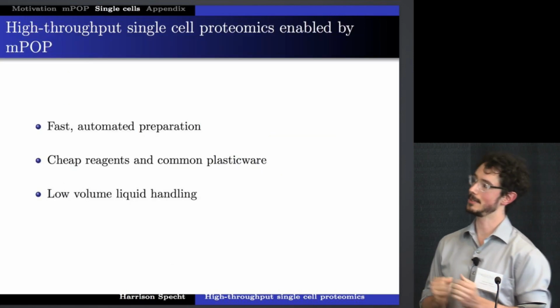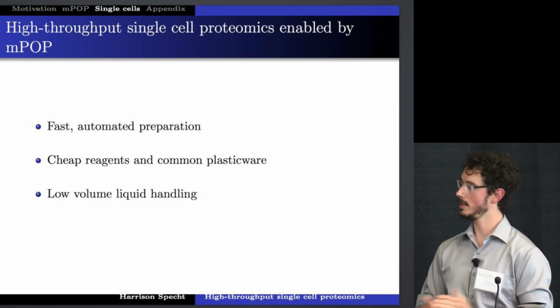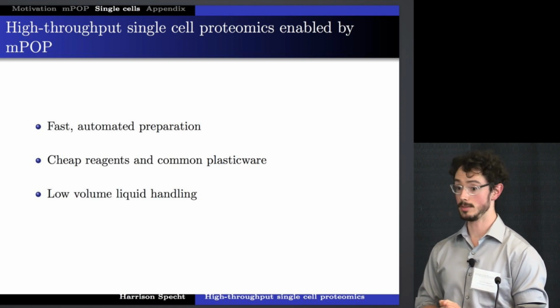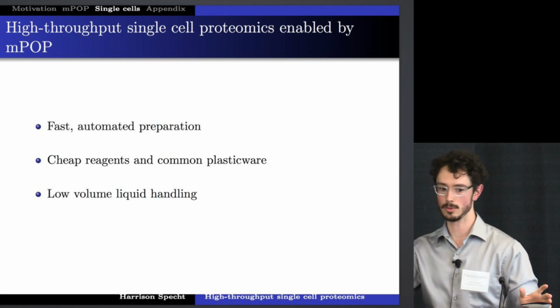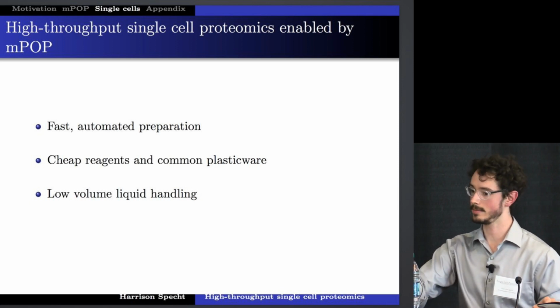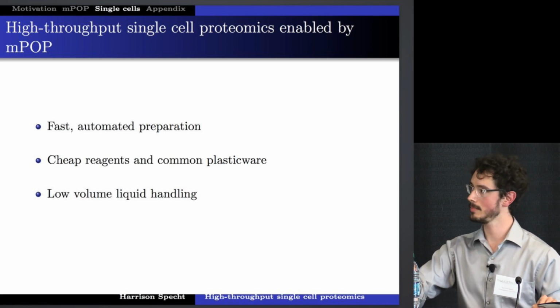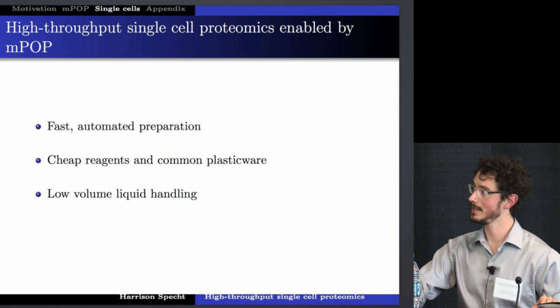I would really love to hear your thoughts on it, and any suggestions on things that we can think about and do. What we did last week was transfect cells with a fluorescent protein. We sorted hundreds of them by FACS while also quantifying that transfected fluorescent protein. We'll use that as an additional internal reference sample and process them just like this. I hope to show you that data soon.